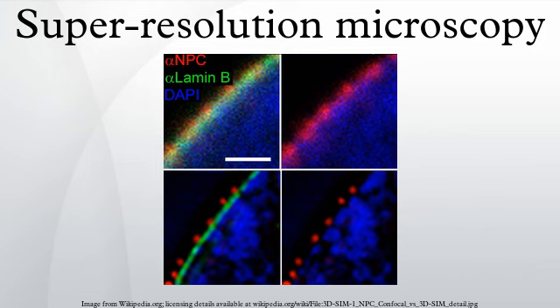SPDMPHYMOD. Localization microscopy for many standard fluorescent dyes like GFP, Alexa dyes and fluorescein molecules is possible if certain photophysical conditions are present. With this so-called SPDMPHYMOD technology, a single laser wavelength of suitable intensity is sufficient for nanoimaging, in contrast to other localization microscopy technologies that need two laser wavelengths when special photoswitchable or photoactivatable fluorescence molecules are used.